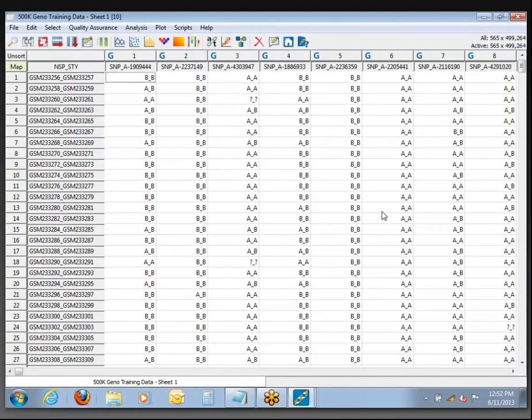Since most of you will have the 32-bit version, you might find some things you're doing are going to run a little bit slower than what they're doing on my computer. We decided to share the 32-bit version in case anybody only had access to 32-bit.